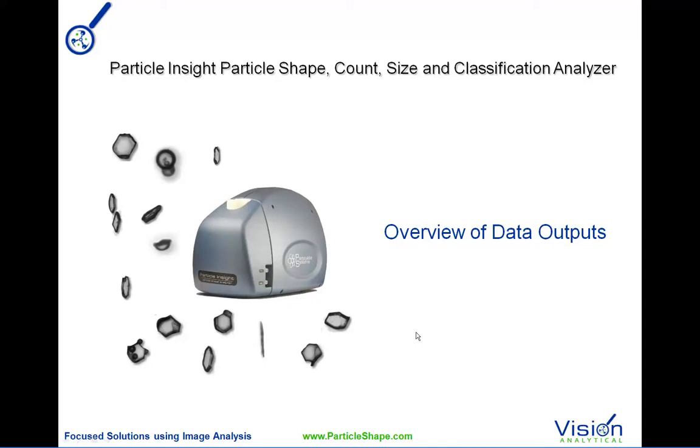This presentation will be going over a few of the different data outputs that the Particle Insight has. The Particle Insight is a particle shape analyzer that works at very high speed and can give you an enormous amount of information. We have up to 30 different shape measures. For every particle that is measured in real time, we calculate up to 30 different shape measures and update statistical histograms in real time, and keep a thumbnail of the image.